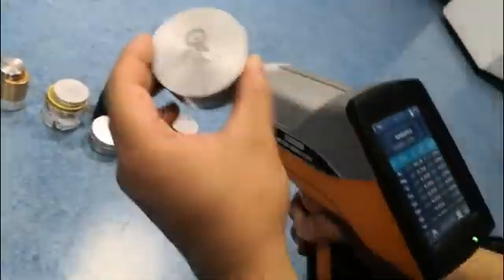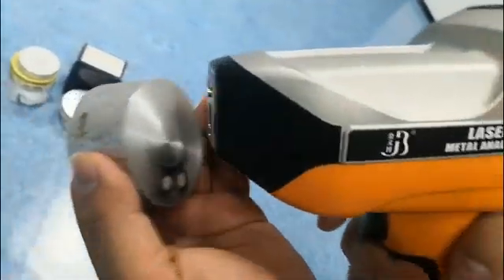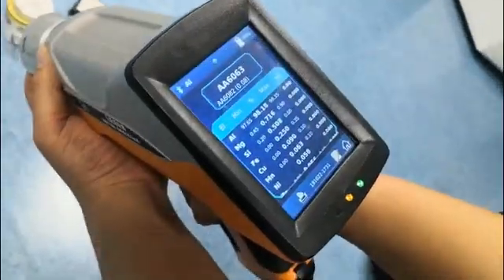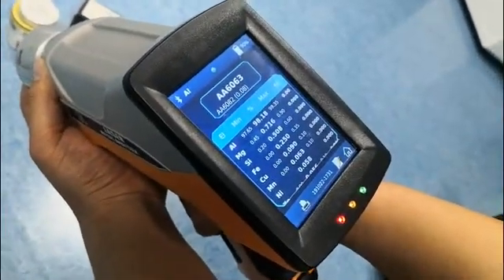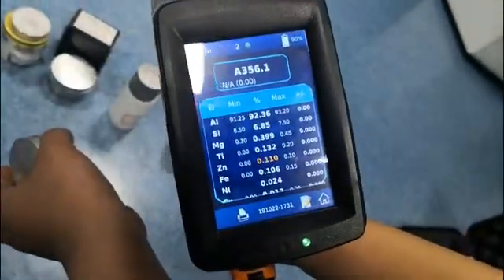We move to another sample. Put the sample here. Okay, this is 356.